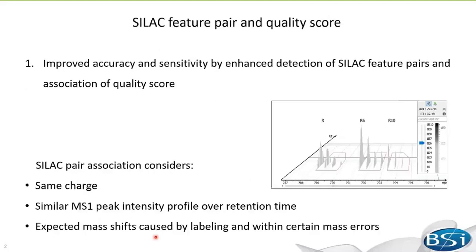I will start with some SILAC data analysis basics with PICS Q. Here we are looking at a SILAC 3-plex data. The proteins were labeled with arginine light, arginine 6, and arginine 10, and then combined.